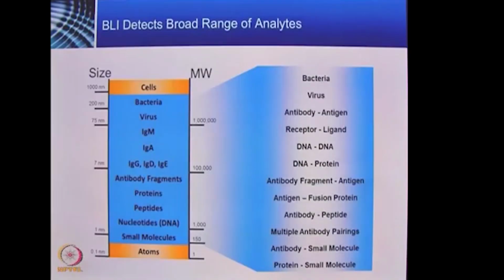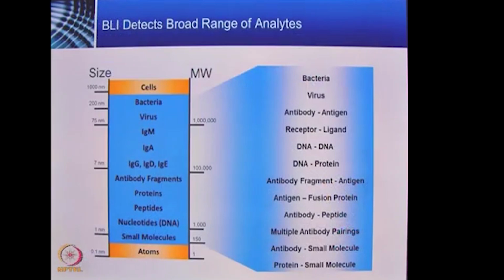Because the BLI technology is developed based on this biosensor, which can work with different sample types, it allowed us to analyze the interactions between biomolecules from molecules down to 150 Dalton, to antibody, to recombinant protein, to virus, and to bacteria. However, this system may not work directly with intact mammalian cells because the size of the cells has exceeded the limit of detection.